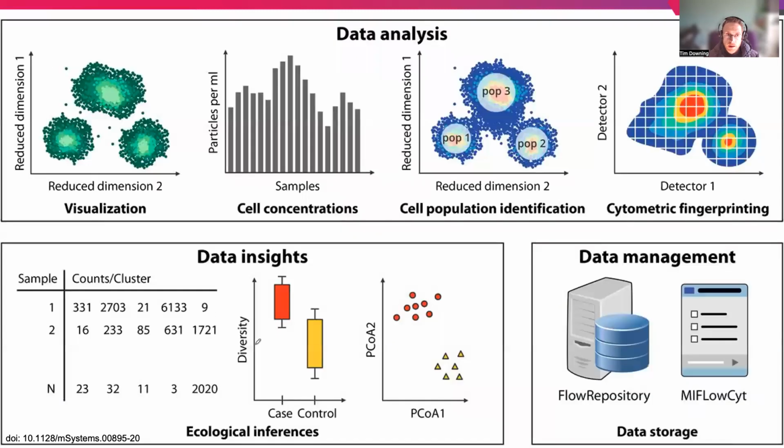Then we can move on to the main analysis. So we could have dimension reduction methods that are typically based around correlation, and we'll talk about those further. We can talk about maybe the levels of scales or the level of molecules that are of interest. It might also be of interest to discover particular cell lineages. There might be other features that are worth examining depending on what the goal is, and that will allow more quantitative associations between different features to be made depending on the idea. This is PCoA, which stands for Principal Coordinates Analysis.